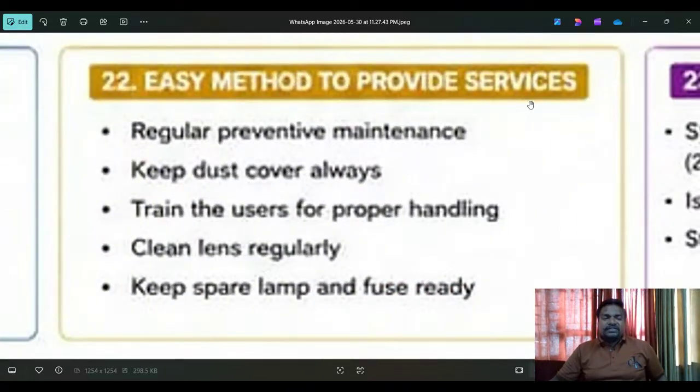Easy method to provide services. Very, very easy. Regular preventive maintenance is very important. See, how to do the preventive maintenance, I will cover in another video.